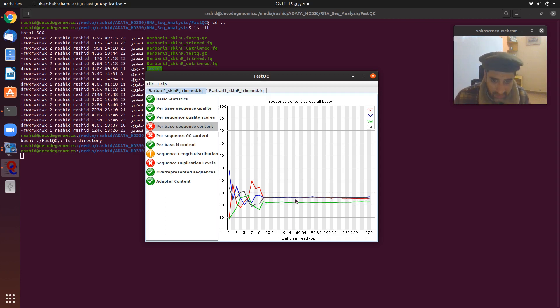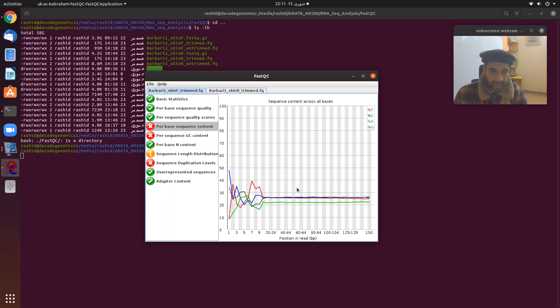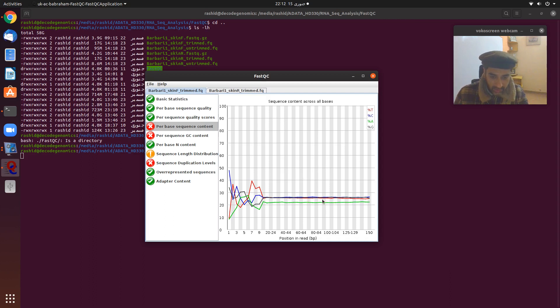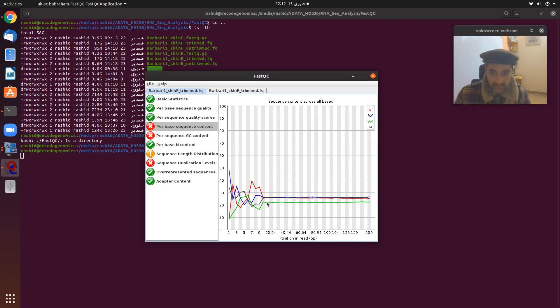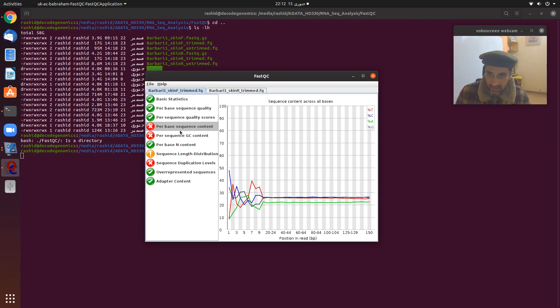For per base sequence content, in the start of the sequencing we can see some noise and then it becomes smoother. However, something looks not good here: the GC proportions and the AT proportions should be in the same respective proportions across the read, but here that is not the case. That is why this software has flagged it with a cross, indicating a warning or fail.